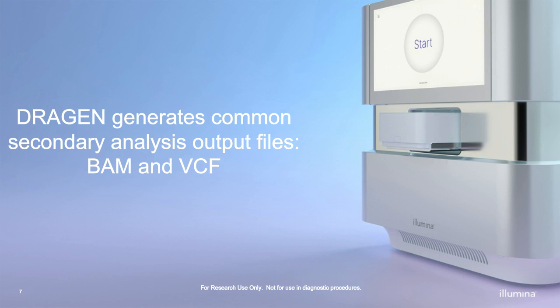Okay, so now that we know what DRAGEN is, let's talk about the files that it outputs. DRAGEN generates the same types of files as most other alignment and variant calling pipelines, both Illumina and third-party pipelines. So these file types are BAMs and VCF, so let's talk about these a little bit further.